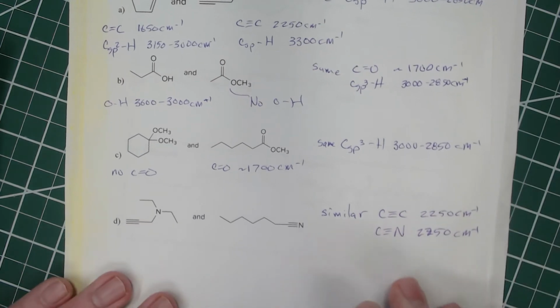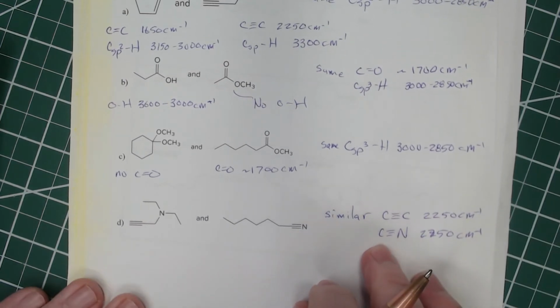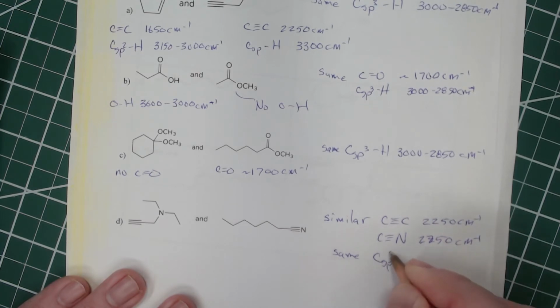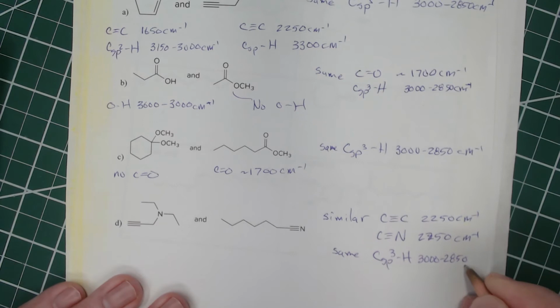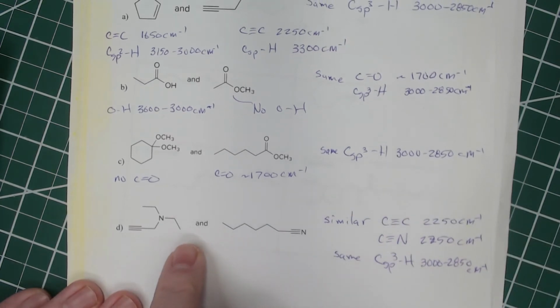Since those are so close to each other, you may not be able to distinguish between those two. And then as far as what's the same, they both have carbon sp3 hydrogens, which again are 3000 to 2850. All right, and that's it.